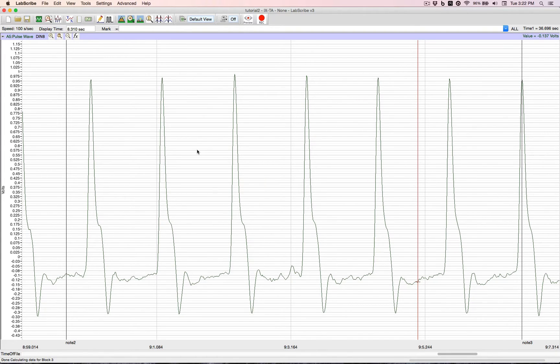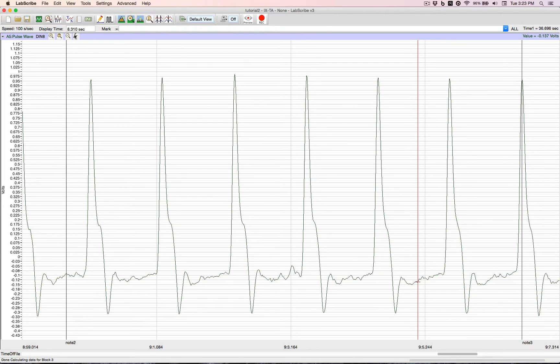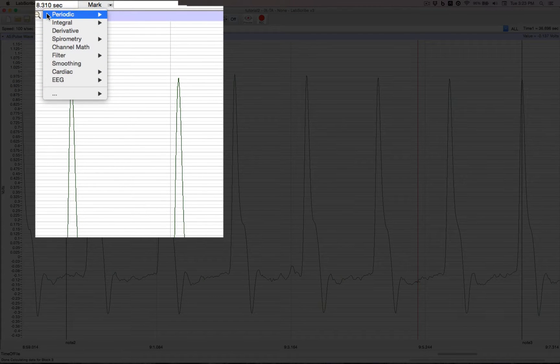You can set up virtually as many computed functions as you want. And the way we do that is we go up to the Add Function button. We click it and we have categories.